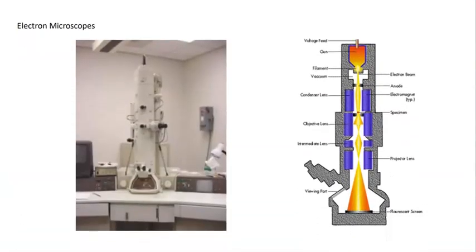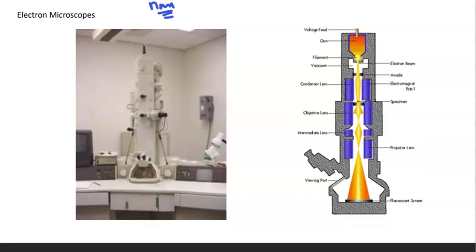Now, as you would have learned from the previous video, the capacity of the electron microscope allows us to look at objects which are measured in nanometers. There's a bit more detail to go with that. Students should be aware that they are not required to have detailed knowledge of electron microscopy techniques nor of the preparation methods. There are some fundamental differences, however, that you ought to be aware of.